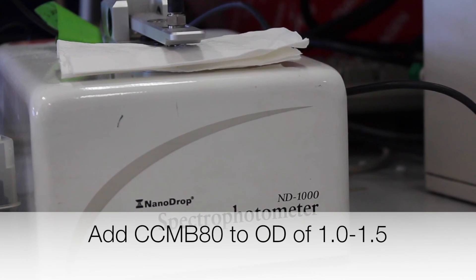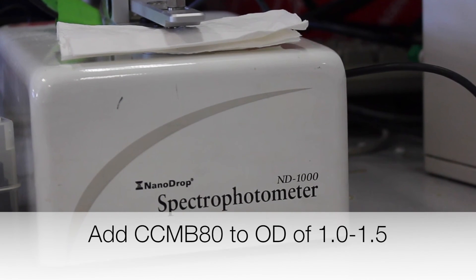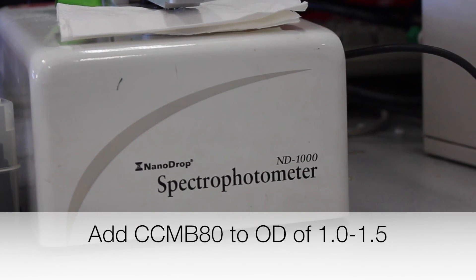Add chilled CCMB-80 to yield a final optical density of 1 to 1.5 in this test.